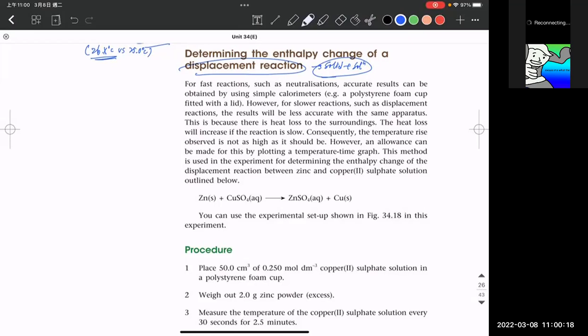Do you realize? We don't need to, but why? Is it possible to measure the temperature of the solid in order to make the results more accurate? Is it to use the powder and measure it with the thermometer? Now it's rather impossible to measure the temperature of the powder, because it's still not possible to measure as accurately as possible, because it's not just the powder that touches the bulb of a thermometer.